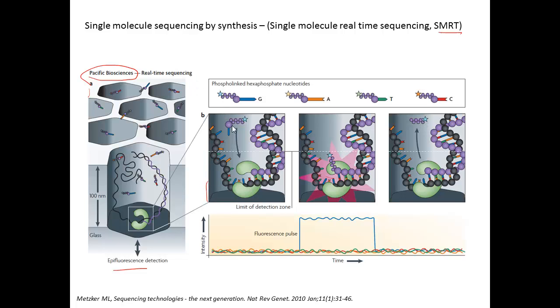So in this case, only nucleotides that are in a certain proximity to the surface will get excited using the light, and only those nucleotides that are being incorporated by the polymerase spend a sufficient amount of time in the well to produce a lengthy signal, and this sustained fluorescence for a long period of time is what gets called as a base. On these dimensions, if a different molecule were to diffuse in, it would diffuse out rapidly enough so that it wouldn't be called as a base pair.